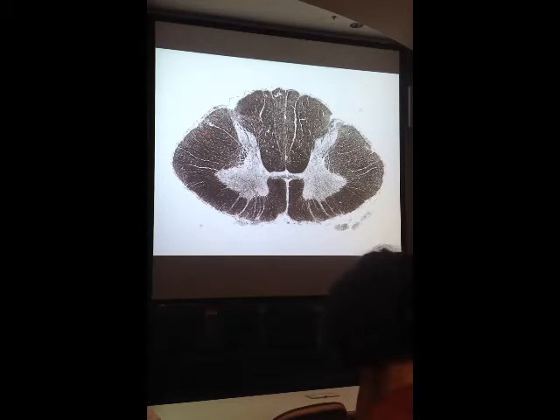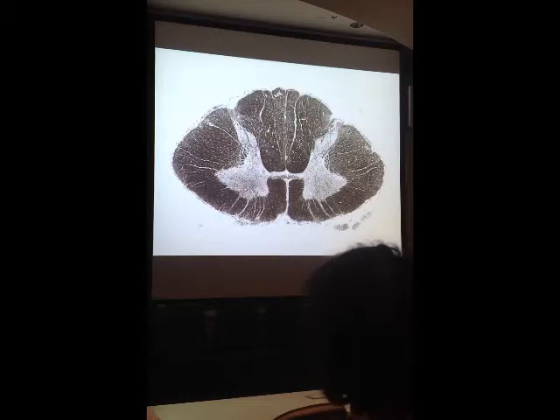Remember, those are the fibers that originated from the nucleus dorsalis or Clark's nucleus. So that's another major ascending pathway that you should know. Now, in addition, we said that there is an important fiber tract located right here, just off the tip of the dorsal horn. If I ask you to name the major fiber tract located in this region right here, what would you say? Lissauer's tract. Is that fairly straightforward? Lissauer's tract on both sides.